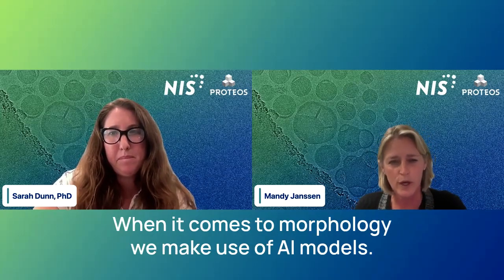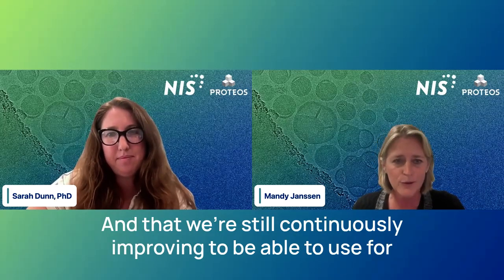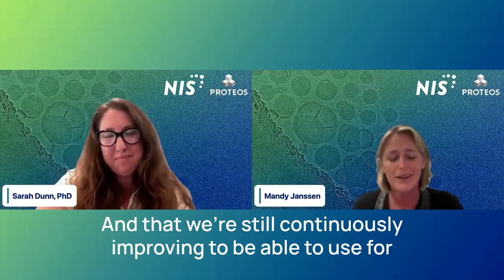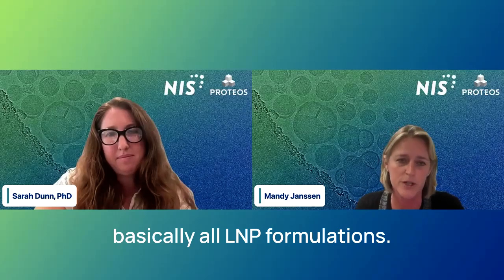When it comes to morphology, we make use of AI models that we're still continuously improving to be able to use for basically all LNP formulations.